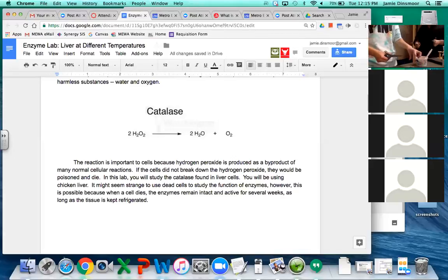You volunteered. It's cold. Don't be like this. Ew, it's cold. Guys, I don't think I can. It's like blood starts gushing. It looks like a ton, guys. Ew. Oh, gross. Is it going to be big enough to fit? What's your happy place? I'm just cooking meat for my family. This is too entertaining. That is gross. Okay, you want to switch? Here.